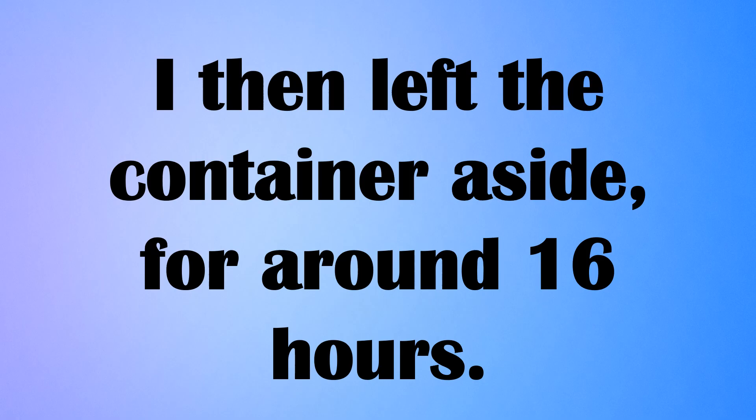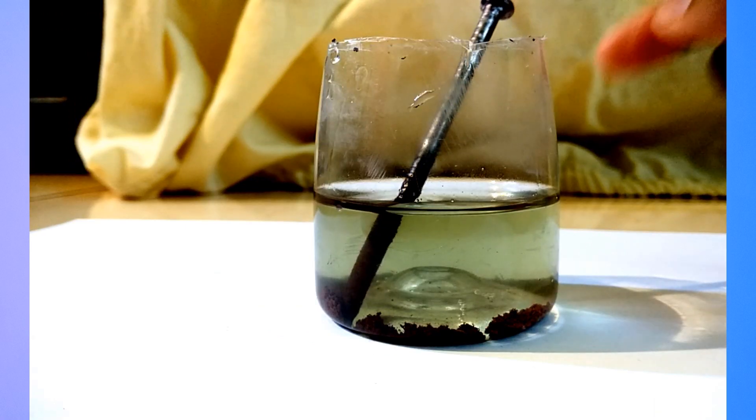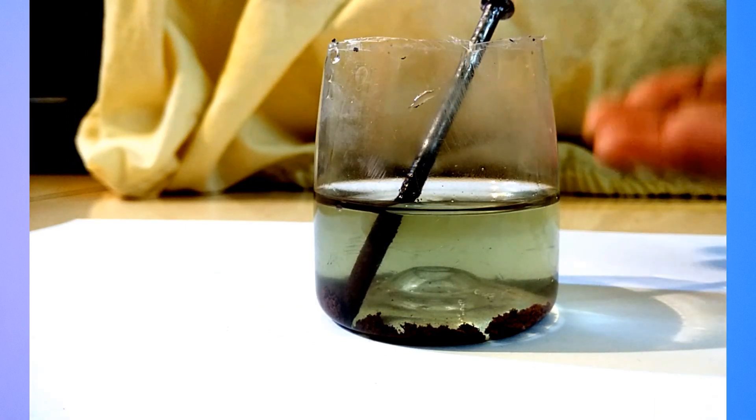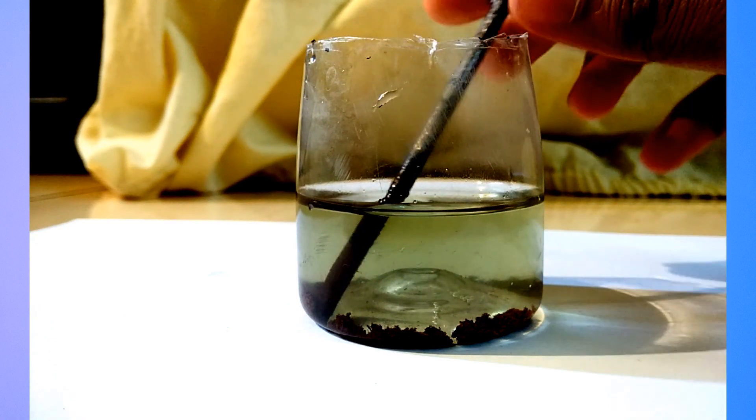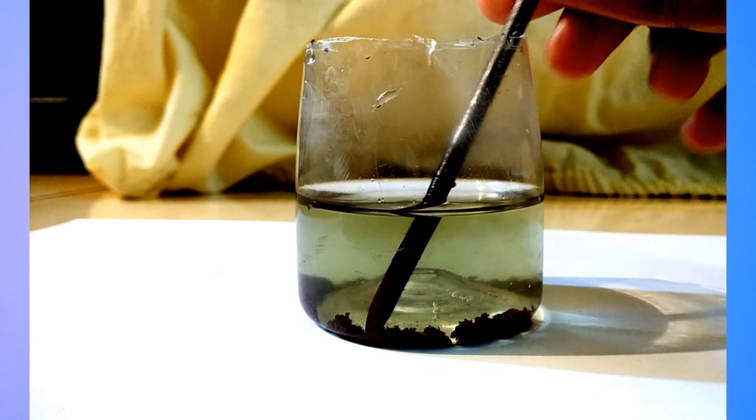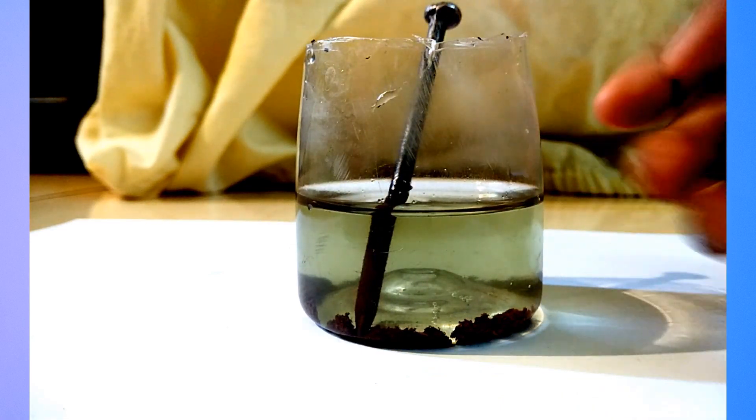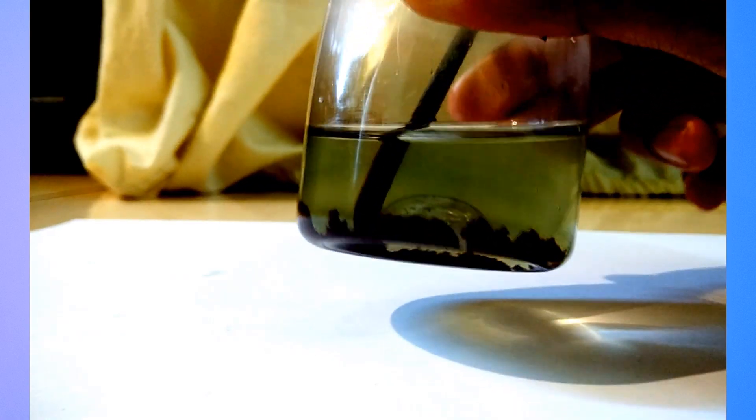I then left the container aside for around 16 hours. After around 16 hours, you can see that the solution has turned into a green colour. There is also a brown colouring in the nail. And some of the flakes which fell from the nail have deposited in the bottom of my container. And they are also brown as you can see.